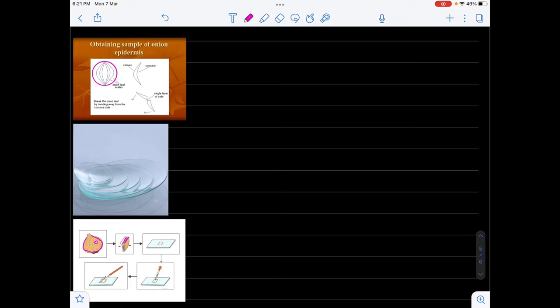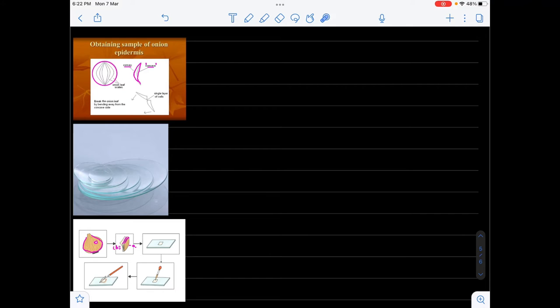Here we can see two sides: one is A and the other is B. Side A is convex whereas side B is concave. This is the longitudinal cut piece of onion. We should separate out the thin onion peel from the concave side and then place it in a watch glass containing water to prevent it from folding.